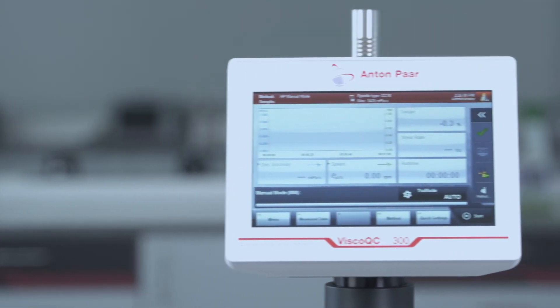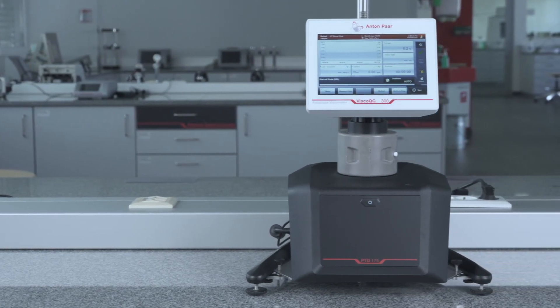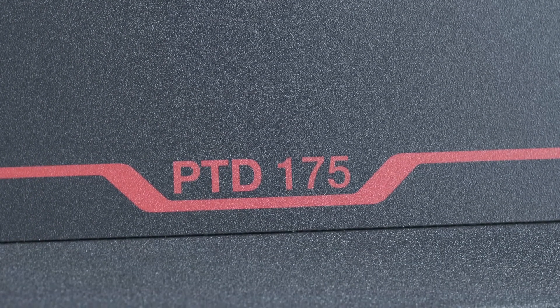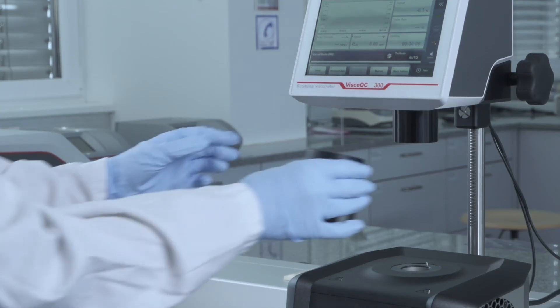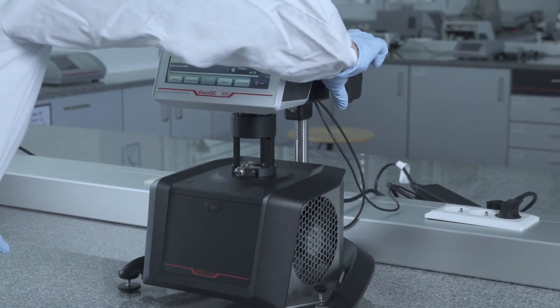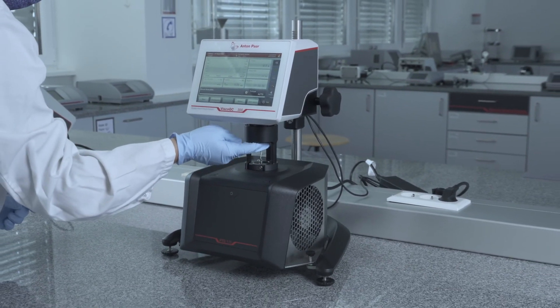Visco QC 300 is also expandable with a unique air counter-cooled Peltier temperature device, PTD 80 or PTD 175. A Peltier temperature device provides the fastest and most accurate sample temperature control. Installed in two seconds, the temperature devices are easily controlled by Visco QC and even start the measurement automatically as soon as the sample itself has reached the set temperature.